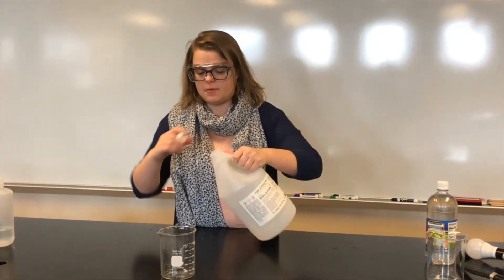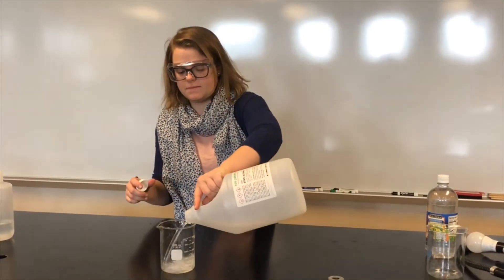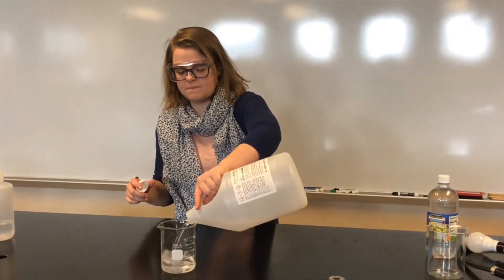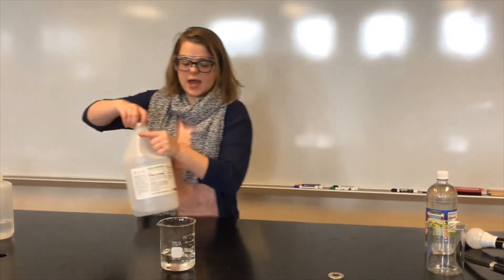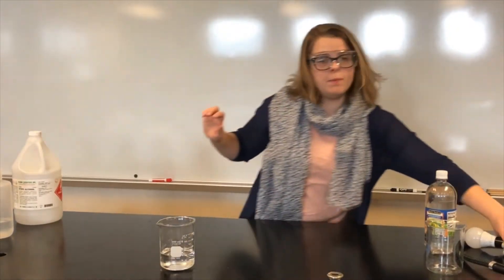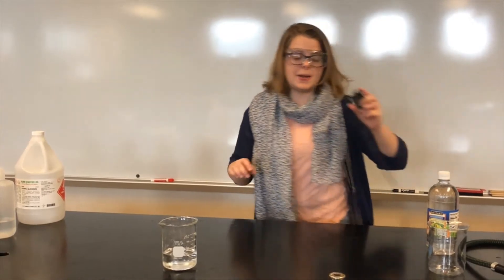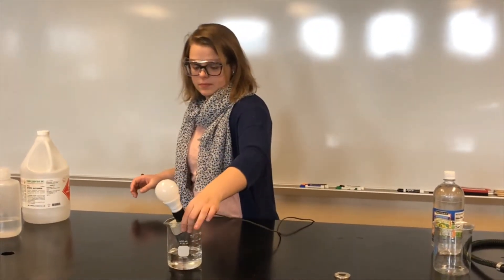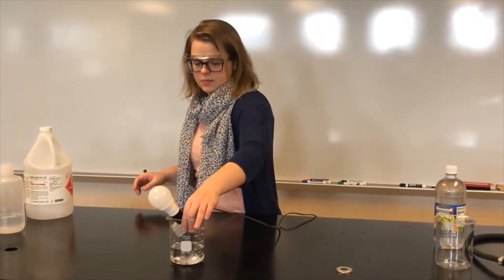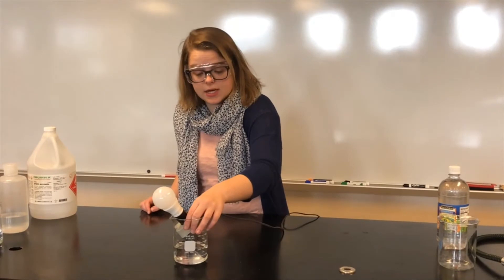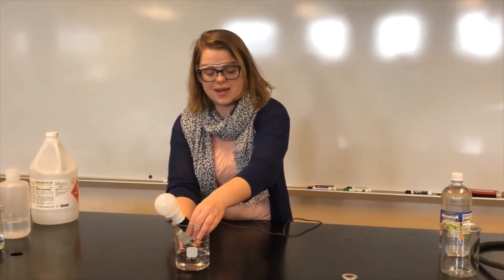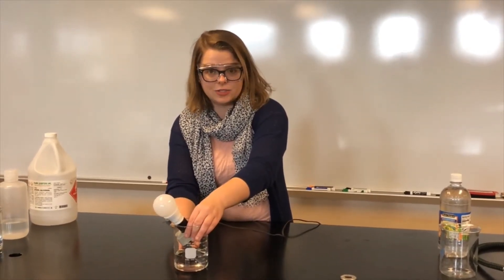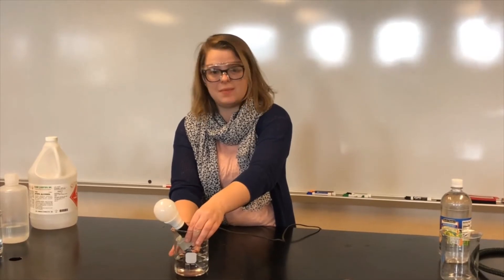So I'm going to pour some in. We're going to go ahead and test to see if our light bulb will light up. As you can see, it doesn't. That's because ethyl alcohol is a non-electrolyte. That means it does not produce electricity — there are no ions present.